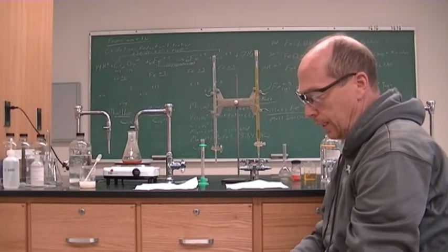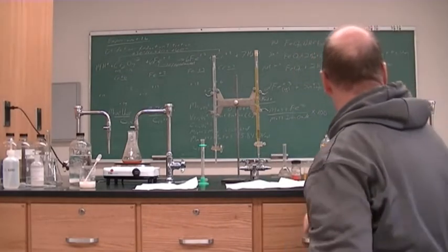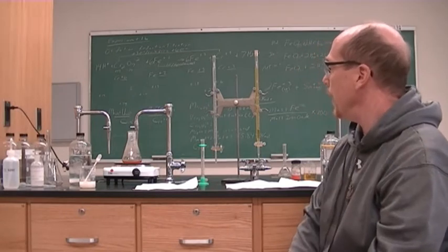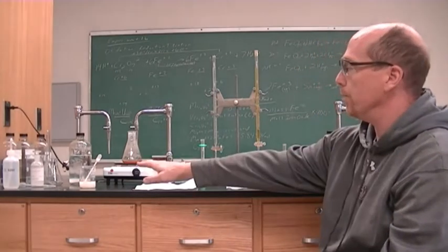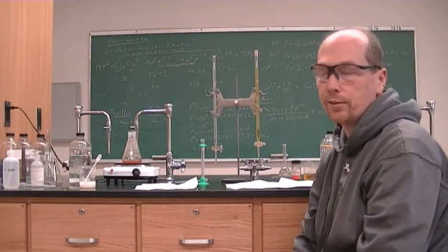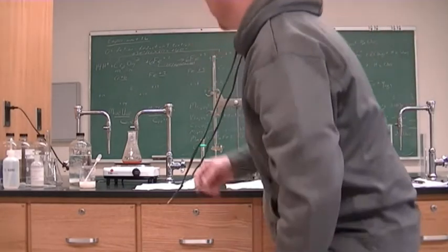And then once I have done that, I'm going to cool it down to room temperature, and I'm going to add some mercury chloride, mercury 2 chloride. And that is going to stabilize any of the extra Sn plus 2 that I have added in getting this to become a clear solution.